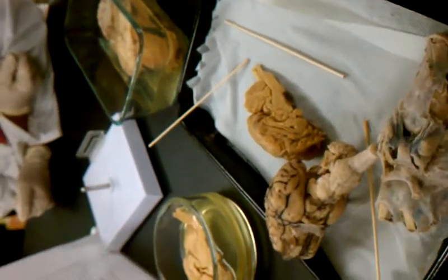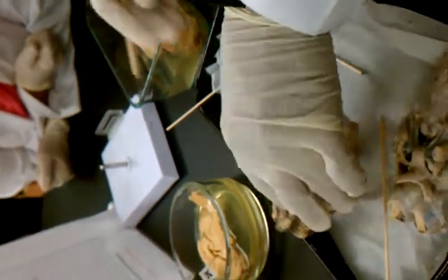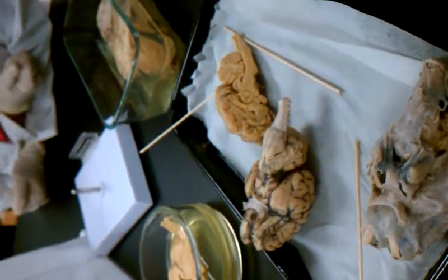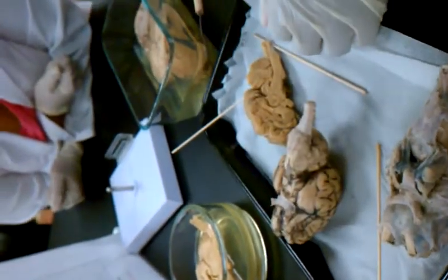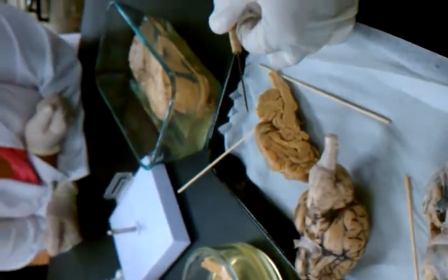We did the superior colliculi, inferior colliculi, pineal gland. Olfactory bulbs are here. Here, here, here, here. Is that behind the occipital lobe? No, it's below the frontal lobe. There is nothing in the front.